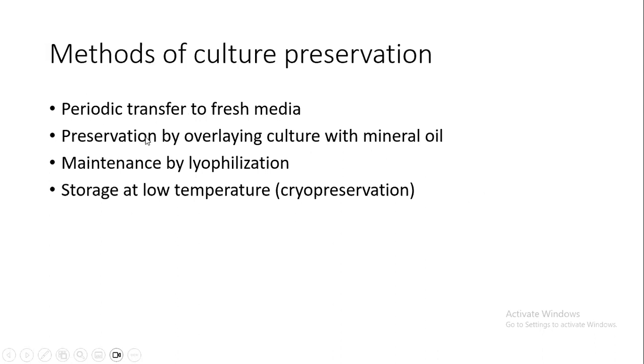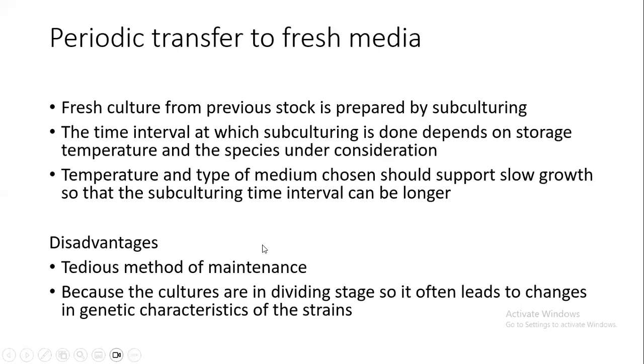So, these are the four common methods that can be used for culture preservation. First is periodic transfer to fresh media. Second is preservation by overlaying culture with mineral oil. Third is by lyophilization. Fourth is cryopreservation.